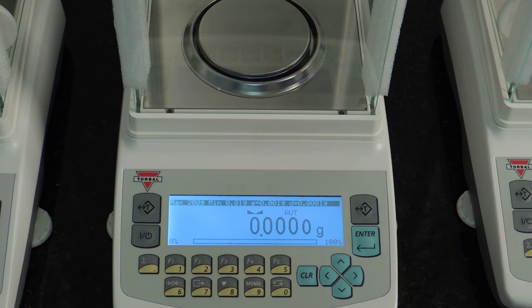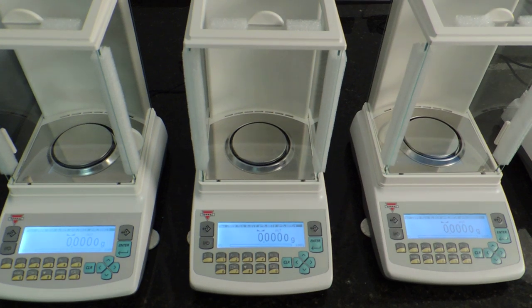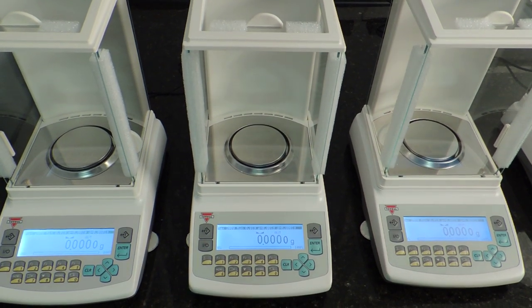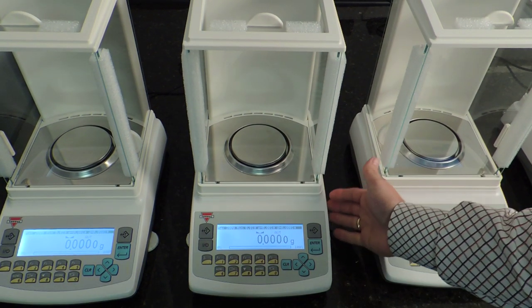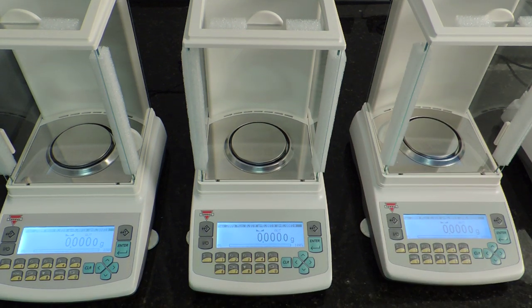The AGN features Torval's signature die-cast metal housing. It's a very rugged, very well-built scale. Both the top and bottom of the housing are all die-cast metal, which makes the scale very sturdy and almost heavy-duty.